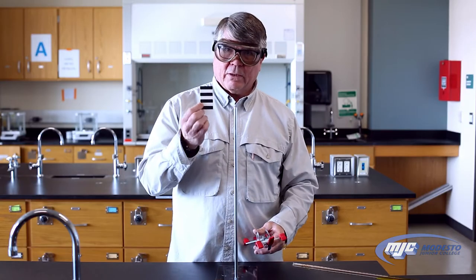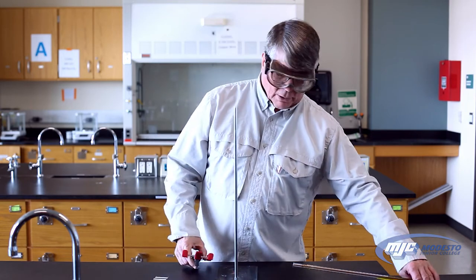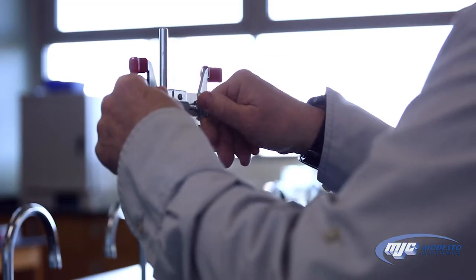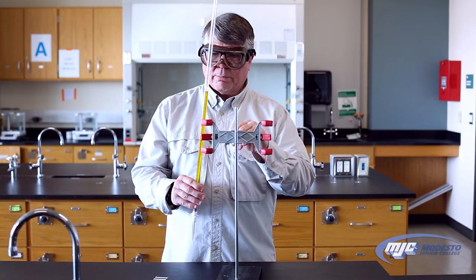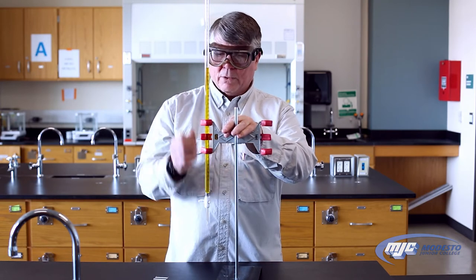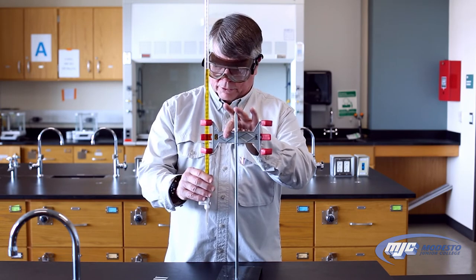Something like this to hold behind the burette for contrast is really helpful. To attach the burette clamp to the ring stand, the hole in the middle with a thumb screw is what slides over the ring stand, and you just tighten it down with the thumb screw. This can hold two volumetric burettes. To hold the volumetric burette, you just open this and put it in there. Make sure it's level, and you can adjust this if you need to read it or do what you need to.